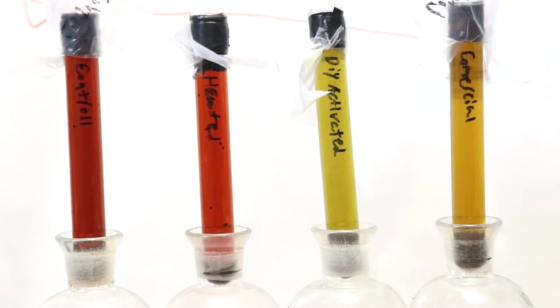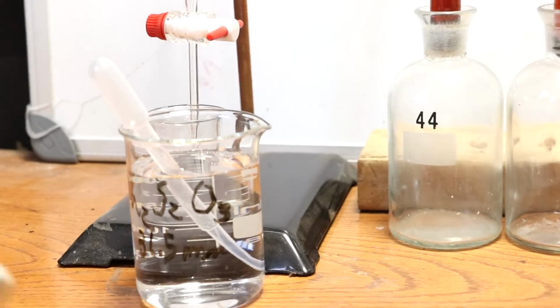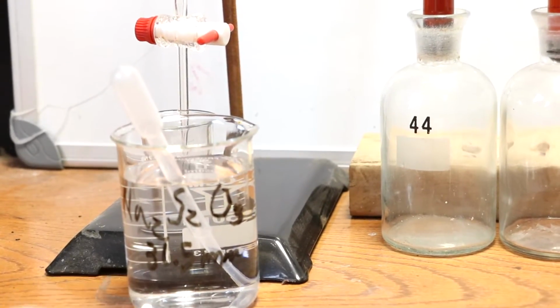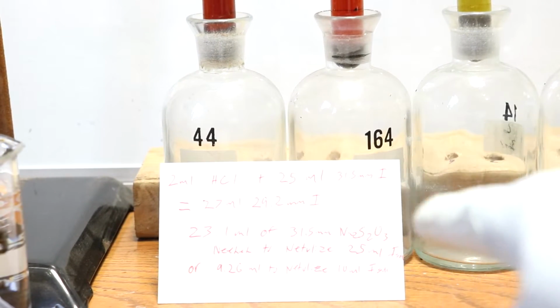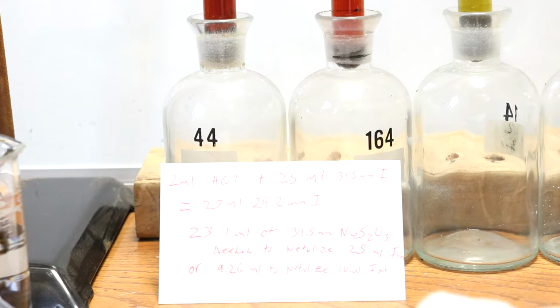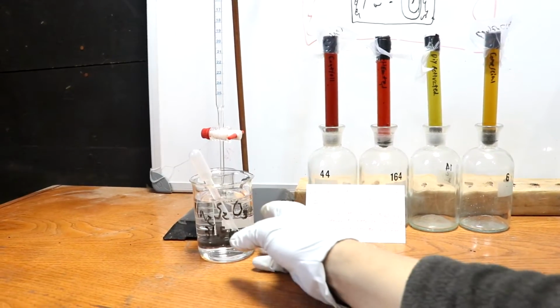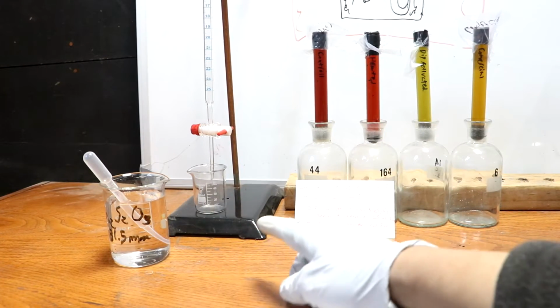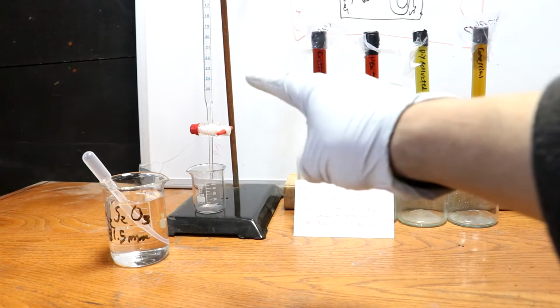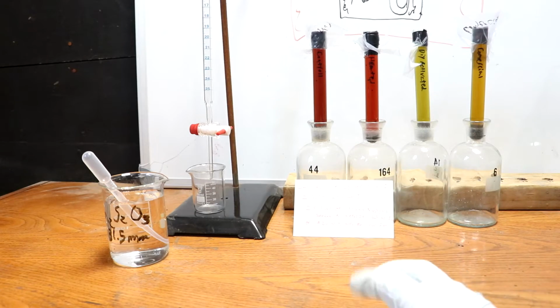But to get some actual numbers, I have set up a burette and a sodium thiosulfate solution, which is 31.5 millimolar, just like my iodine solution was. And before you ask, it did occur to me that since I added 2 milliliters of hydrochloric acid to each vial, it diluted the solution slightly, so I will need less of the thiosulfate to neutralize the iodine. But what I'm going to do is transfer 10 milliliters of the iodine solution into this little beaker, and then I'm going to fill the burette with the thiosulfate, and we're going to titrate and see just how much iodine was absorbed from the solution.